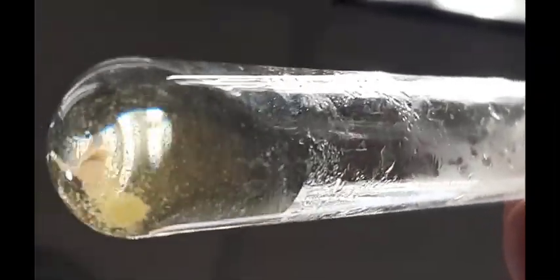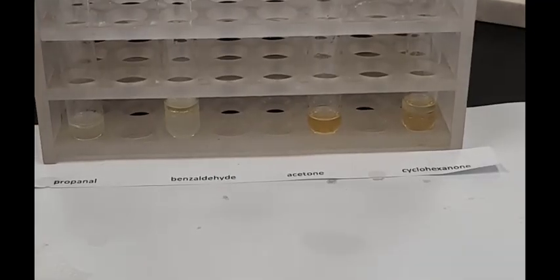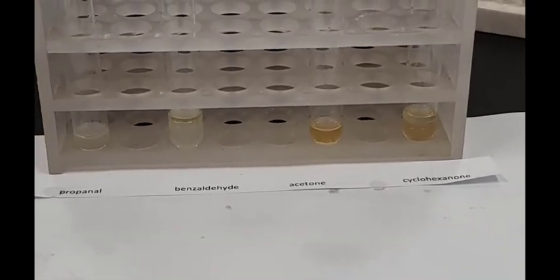The acetone, on the other hand, you can clearly see solid precipitate at the bottom of the test tube. So the conclusion here would be that the only one of these which gives a positive test is acetone. And we also notice that the benzaldehyde and the cyclohexanone are not soluble in water.